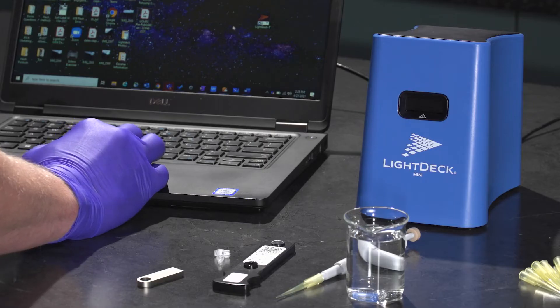Instructions for how to perform these tasks are included within the LightDeck Mini user manual. Let's begin. Open the LightDeck application.